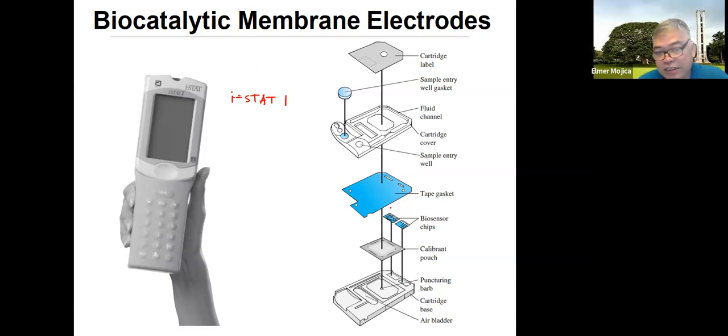So usually I think this one, they're what? Disposable. So every time you analyze, you change it and then put your sample there. So imagine if you have that thing. I remember me and a collaborator of mine, who is still in PNR either, we want something that if we want to test somebody for drugs, all you need to do is what?